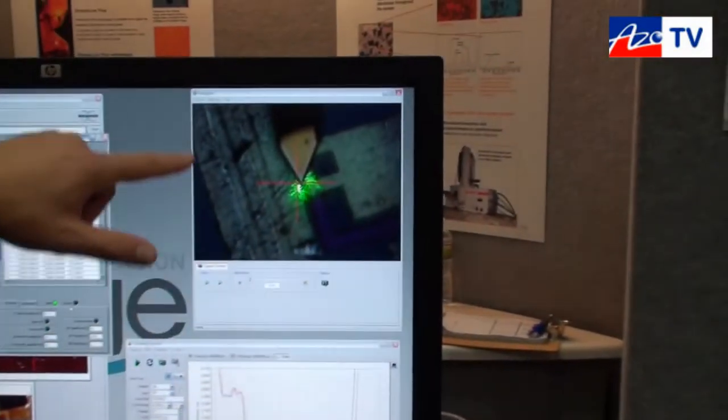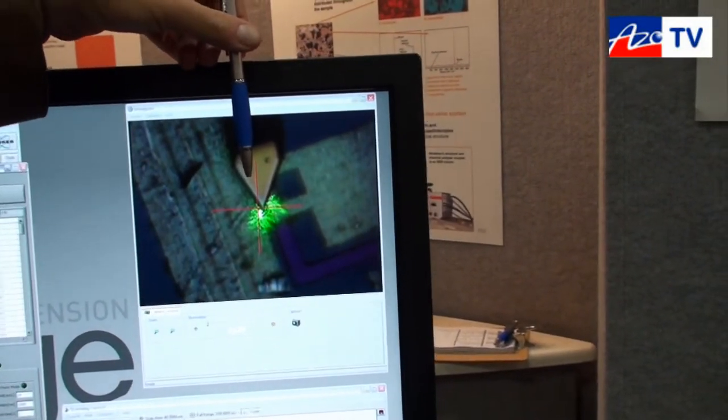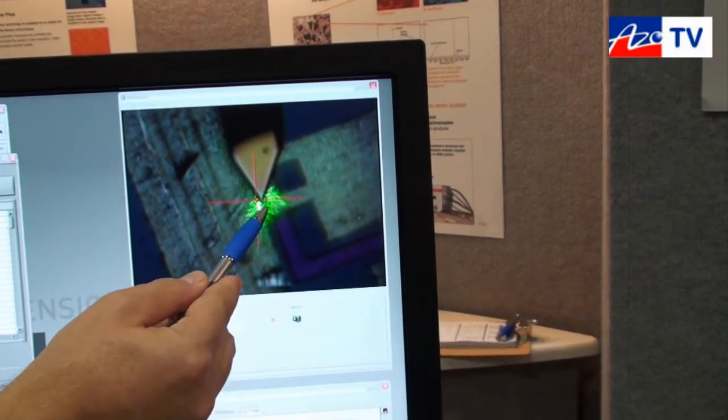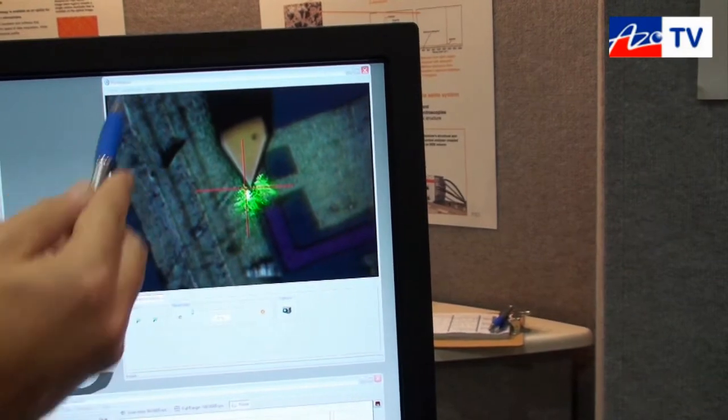What you see here is a video image of our AFM cantilever coming from the top, and you can see the Raman laser illuminating the area around the AFM tip, with the sample in the background.